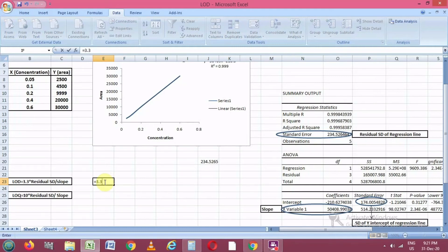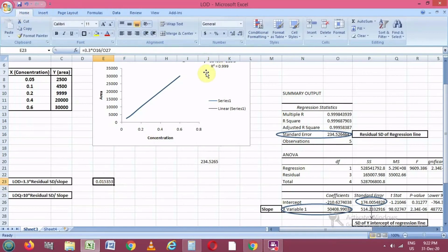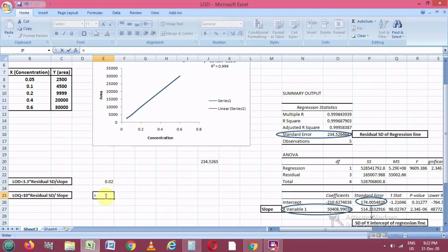We can verify whether the standard error is correct using the Excel function STEYX. We select the Y values and X values and press Enter. The result matches the standard error value from the regression output, confirming that our calculation is proceeding correctly.